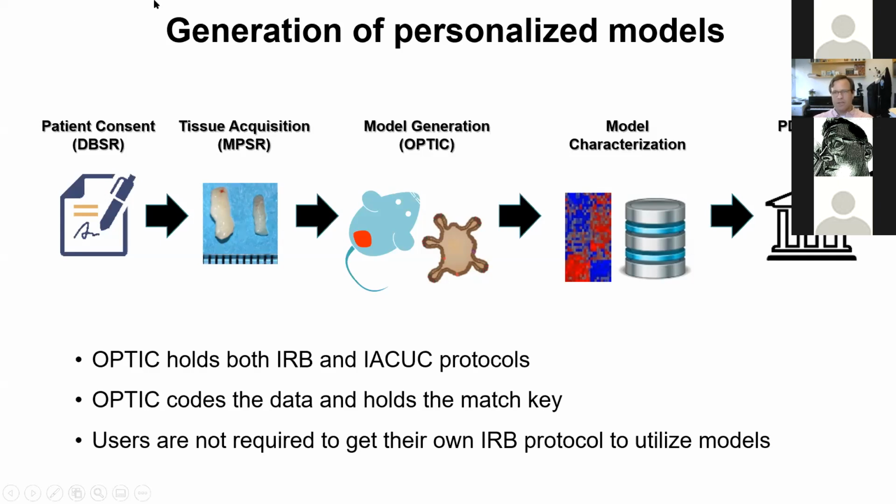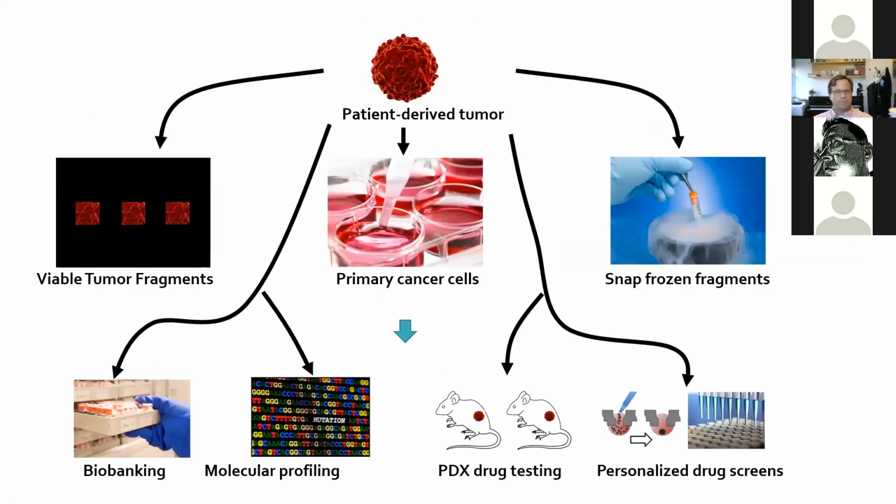Ultimately, our goal is to have a PDX bank that covers dozens of different cancer types, such that eventually someone can come in and just say, I'd like to start up a patient-derived mouse model of X, and we'll already have X in the freezer, know a lot about it, and can tell them, all right, this tumor has mutations in genes A, B, and C, and we can then implant it and run studies very rapidly.